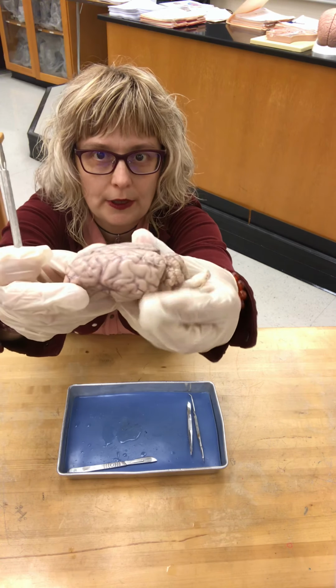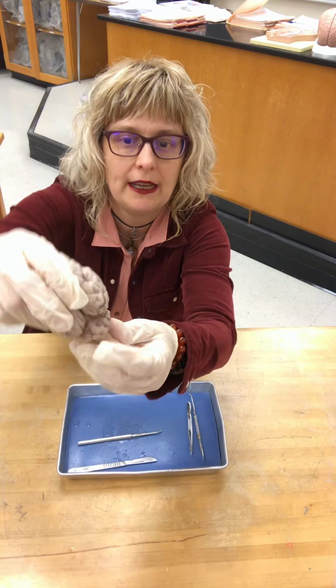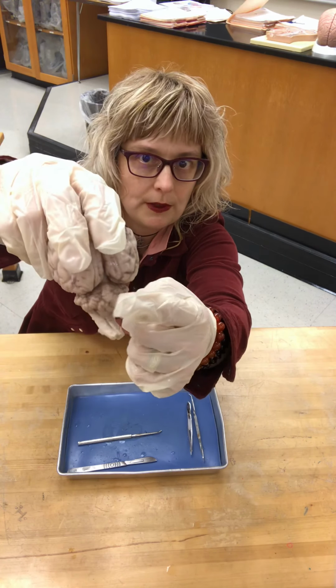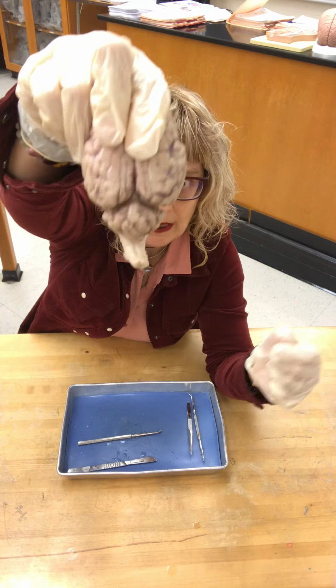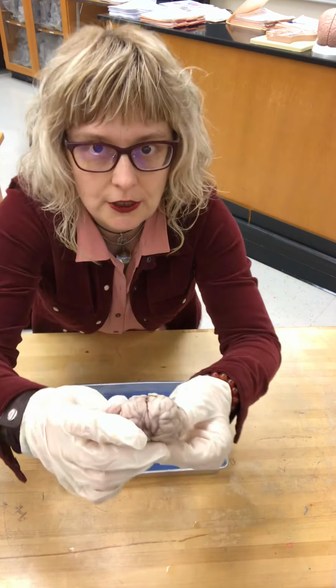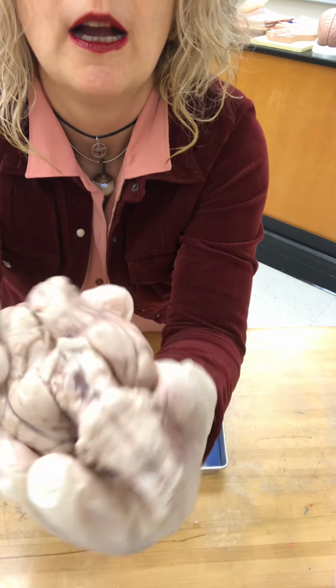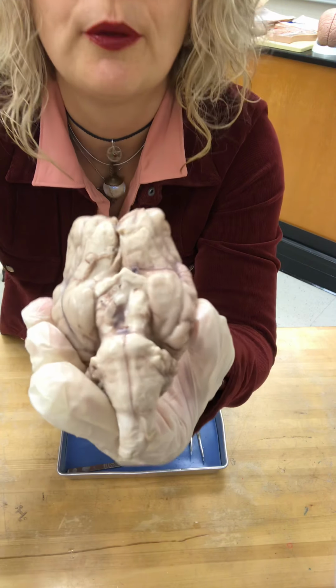All right, so let's bring it close. Right here is temporal. Now the structure that you see back here, that would be the cerebellum, and you could see the spinal cord coming out. Now what I'm going to do is I'm going to stand up so you can see a little bit closer everything here. I'm going to turn it this way so you can see. Now I'm going to use my probe to show you.